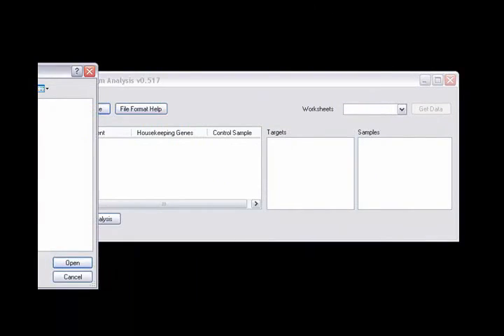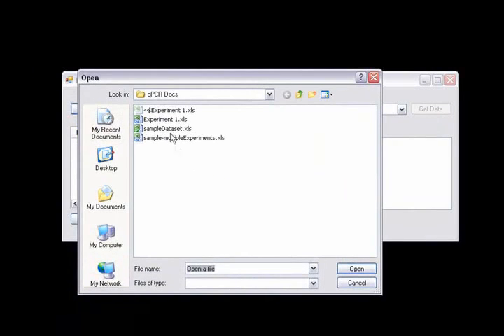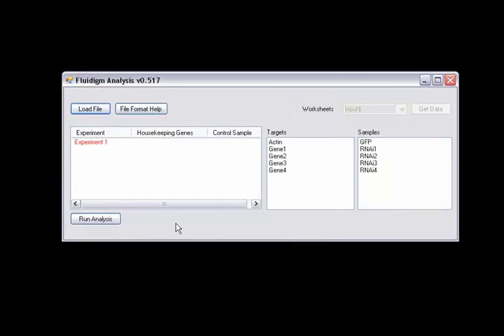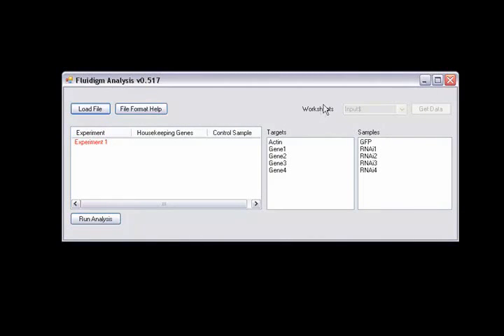When you click on the load file button, I can load up my data set. I'm going to load the sample data set which is included with this package. Because my sample data set only has one worksheet, I don't need to worry about this drop down box. But if you're using an Excel workbook with more than one worksheet, you'll have to select the worksheet containing your data and then press the get data button to load it into the program.